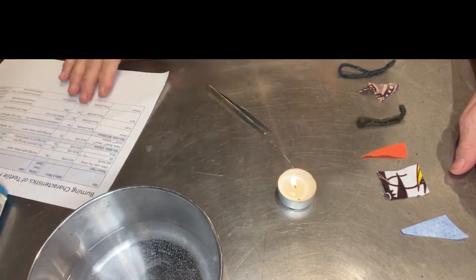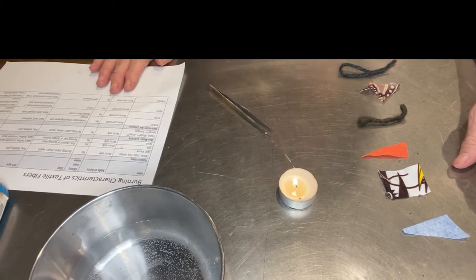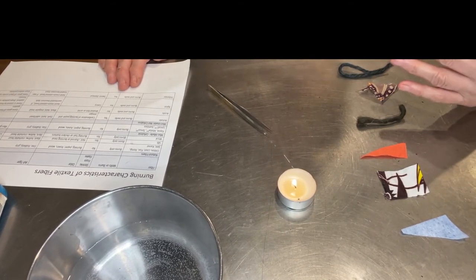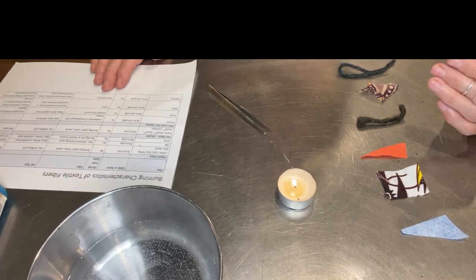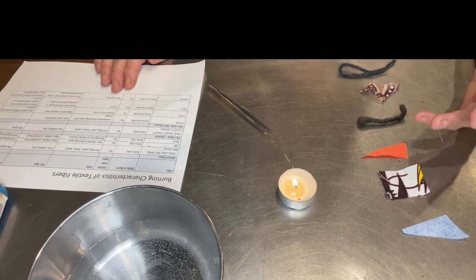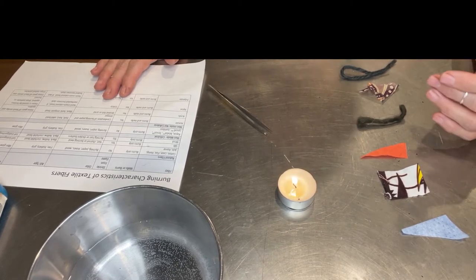I also have a lighter to light my tea candle, and a list of burn characteristics — there's a download link so you can review them. I'd take a look at it before you burn so you know what's going on. You need to observe a few things: before you put it in a flame, get it close — does it shrink from the flame? Does it shrink and then ignite? What does the odor smell like? Does it completely ignite, put itself out, or sputter? And what is the ash type?